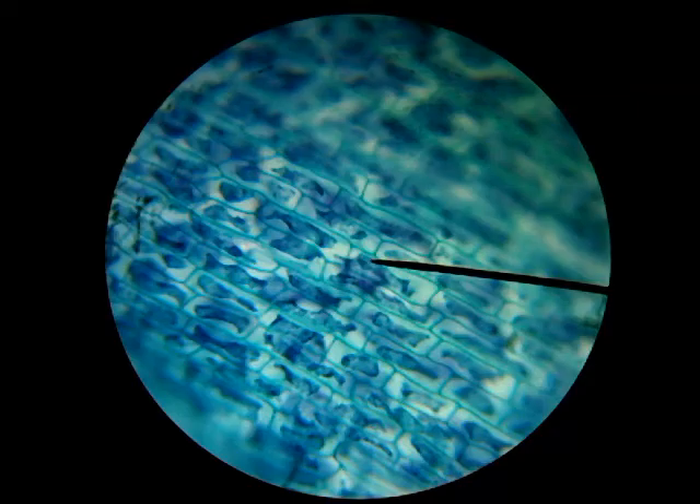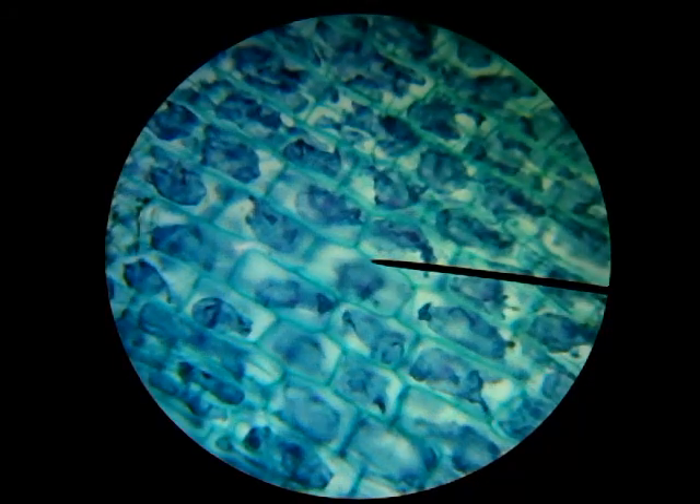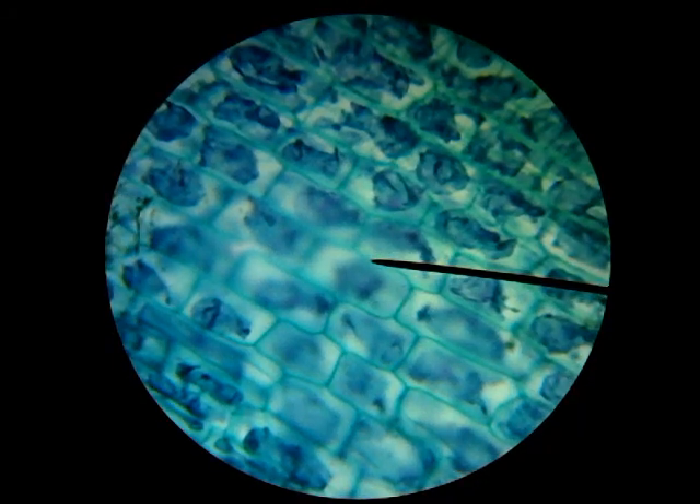On the next few slides after this, you should take some time and draw what you are seeing, so that you have an example of plant cells. This is a really great example of how neatly plant cells fit together and how rigid their structures are because of those cell walls.